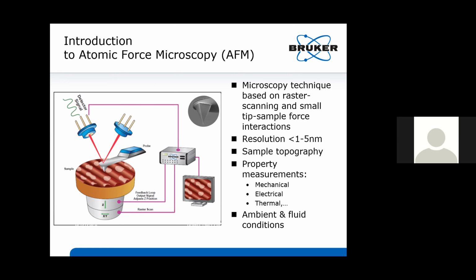And then the XY is creating the raster to do the raster area scan. So it's a rastering instrument. You know, resolution can get down to atomic resolution. Usually people are doing a few nanometers, which is more typical.